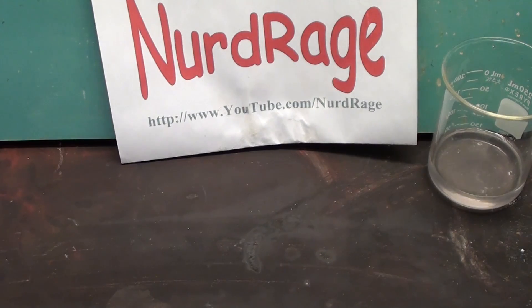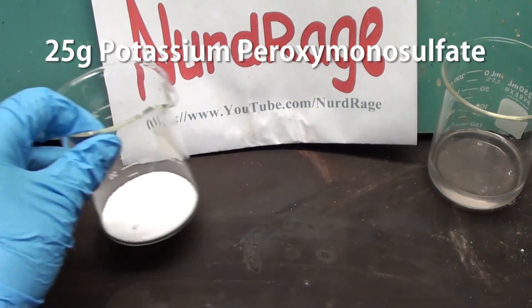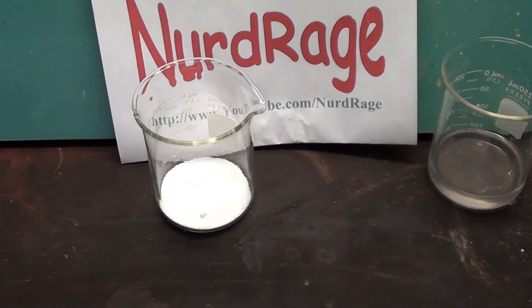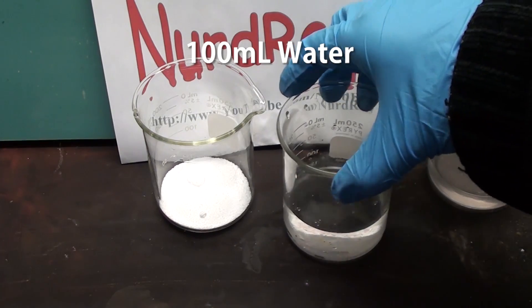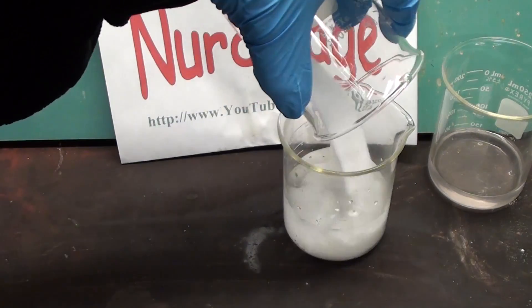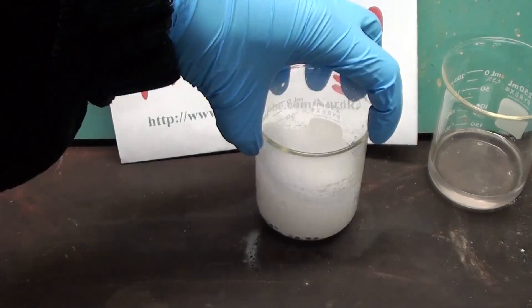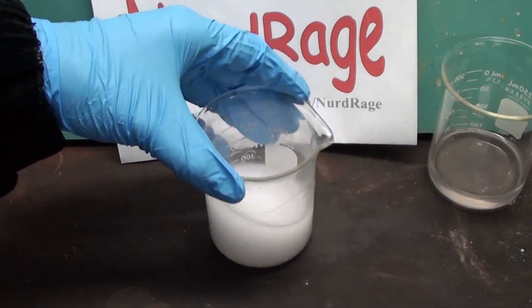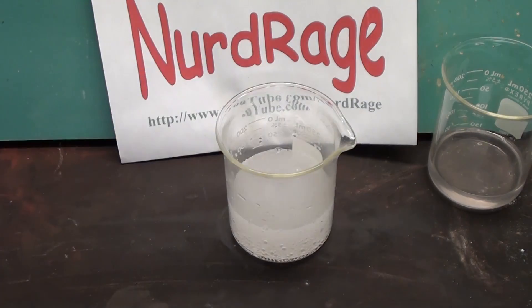Now in separate containers get 25g of potassium peroxy monosulfate, which is sold as a water treatment chemical for swimming pools. Get 100mL of water and add the potassium peroxy monosulfate to it. It'll bubble a lot as oxygen is released. Shake to dissolve as much of the potassium peroxy monosulfate as you can, but don't take more than a few minutes or it'll decompose too much.